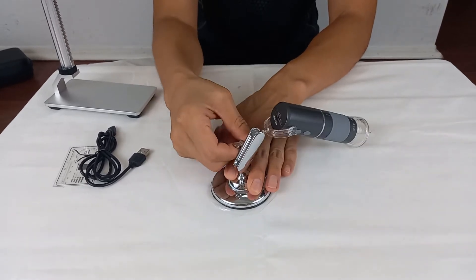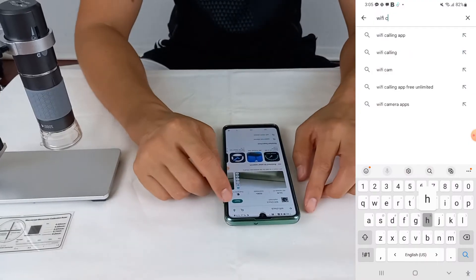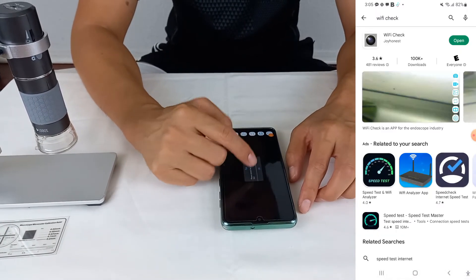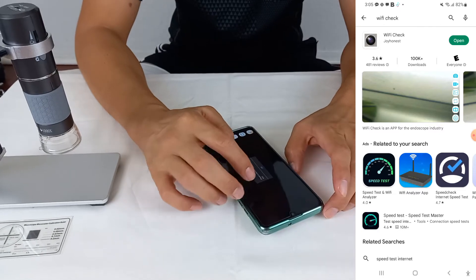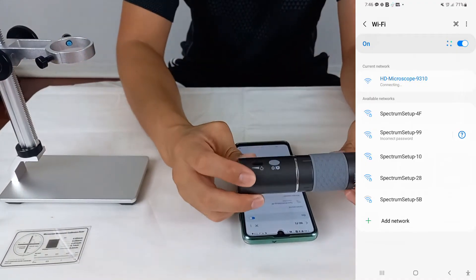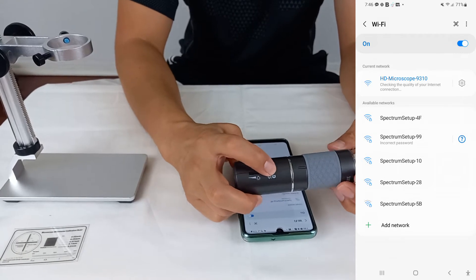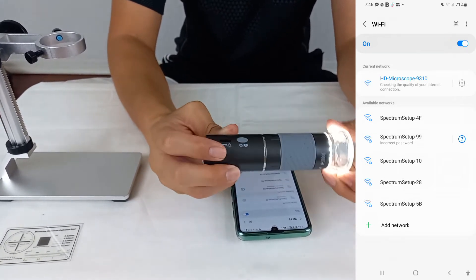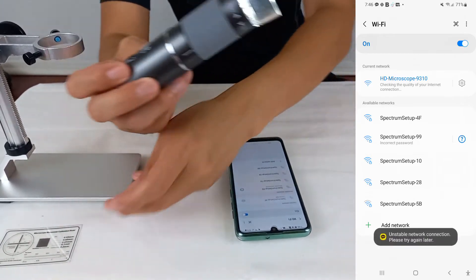I tried to connect it using my phone because the manual says that it is possible to observe on the phone. I downloaded an app called WiFi Check and installed it. I connected the microscope and cell phone using Wi-Fi. Now, let's try a test, shall we?